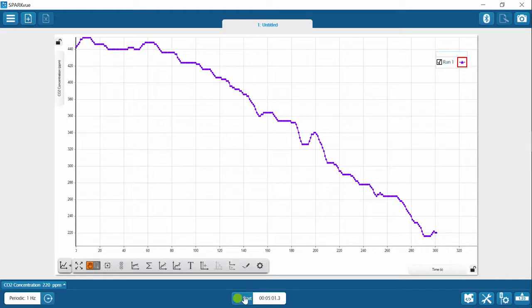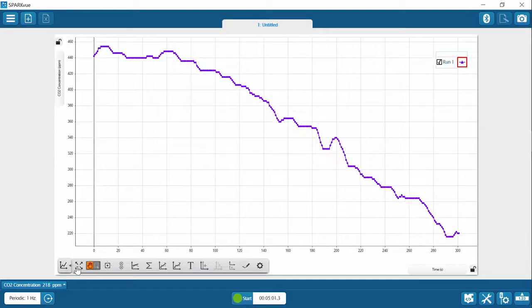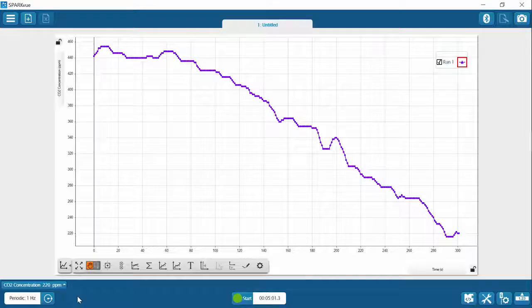Okay, all right, so stop collecting data after the 5 minutes and scale the graph if necessary. Just click those cross bars right there. You're going to want to sketch this data into graph 1. Label both axes and include units and a scale. Identify the data run as light in the key.